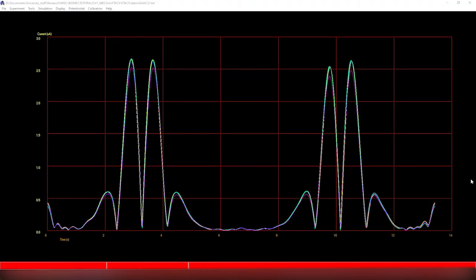Quickly fit that with MECSim and show you the process of doing that. For ease, I'm probably just going to use the first harmonic as well with some data I've fit to the capacitance as well.